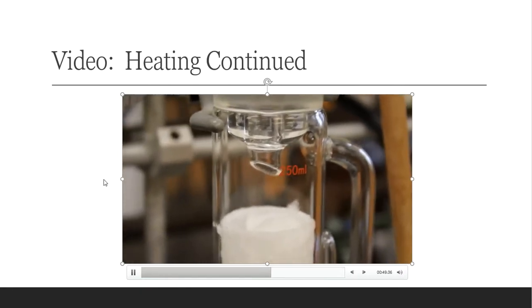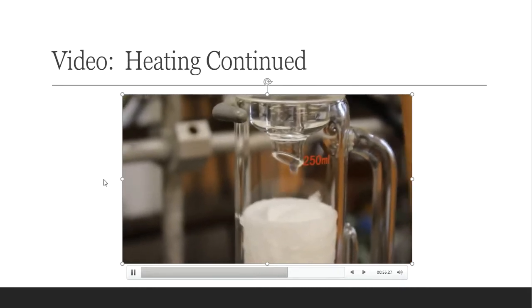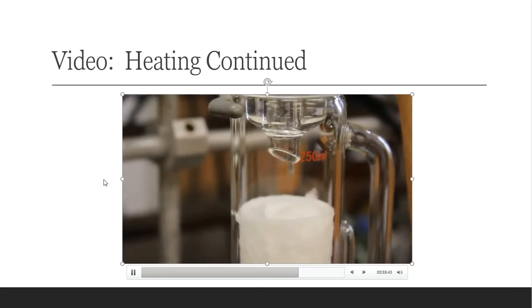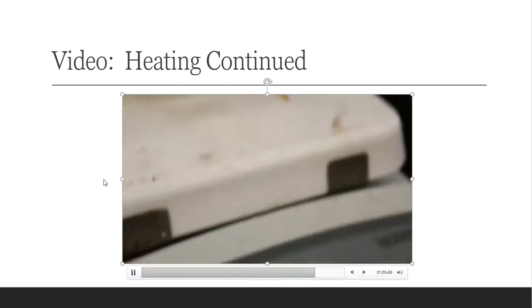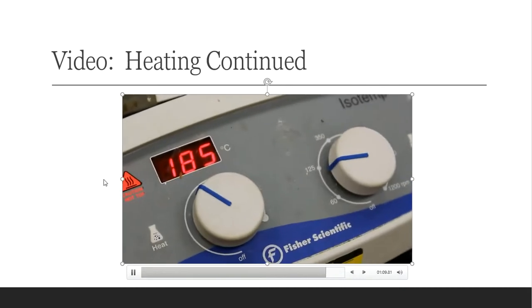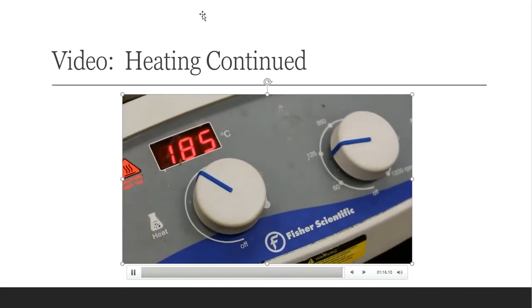All right, so I'm going to continue to let this go. I'm going to continue to record my rollover times and see how long it takes for that rollover to happen. And if it's too fast or too slow, I'll fiddle with my temperature setting on my hot plate until I get something that actually works. If you want to know what that temperature setting is right now, this is what I have it set at. All right, so more observations to record for a lab notebook. Yay!